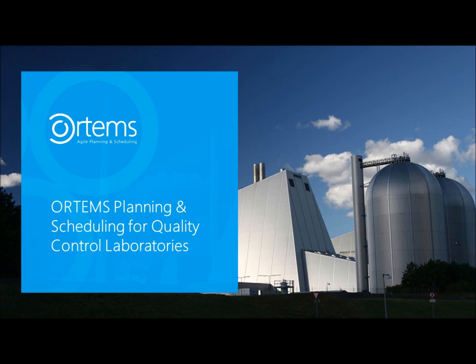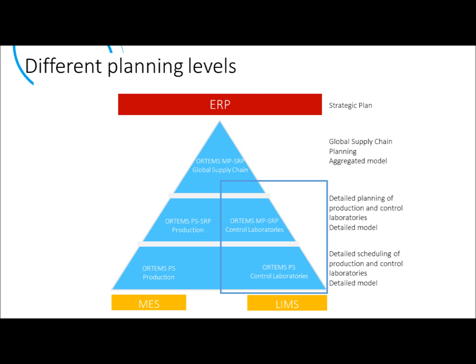Hello everybody. Let me show you today Ortems as a planning and scheduling tool for quality control laboratories. So basically Ortems is dealing with different levels of planning, either in production or in your control laboratories. Let's today focus on your control laboratories from a scheduling point of view and a detailed planning point of view.